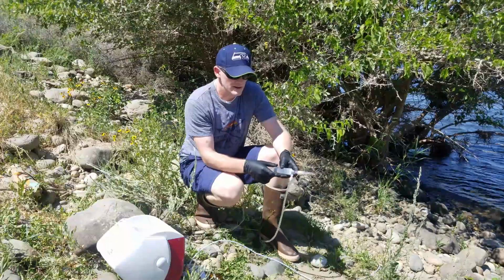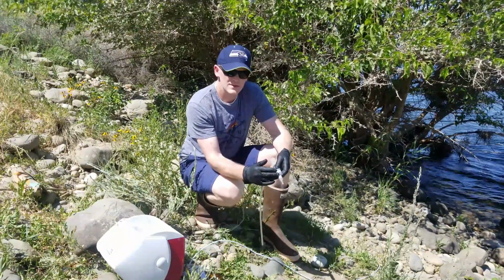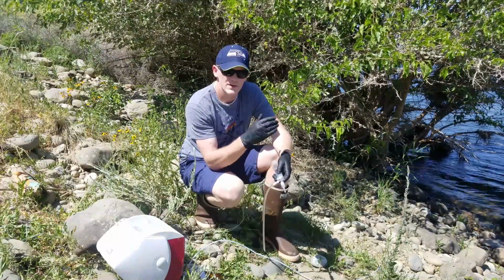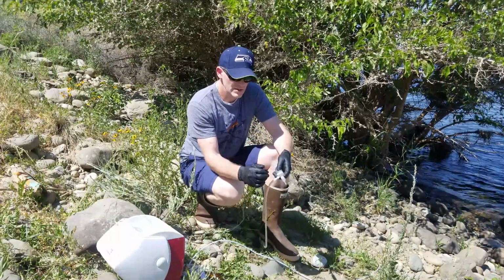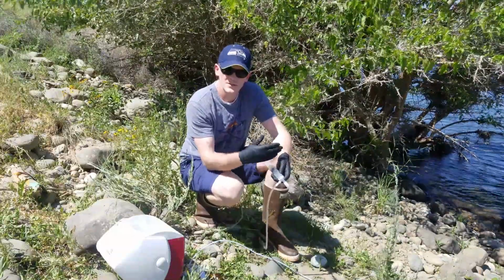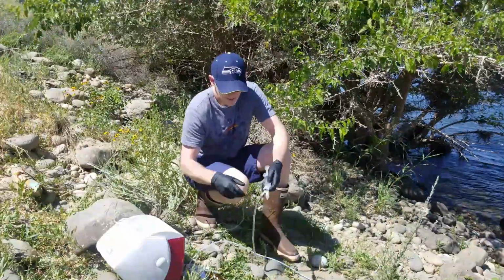After you've got the water in there and your filter is attached, and remember this is a new filter, not the same one we're using for the surface water. We're using one filter for all 3 push points. Once you get the filter attached and you've purged the syringe just as you did for the surface water, then take the cap off.